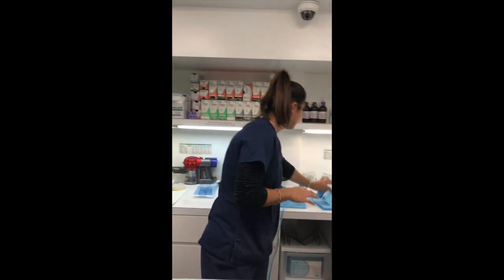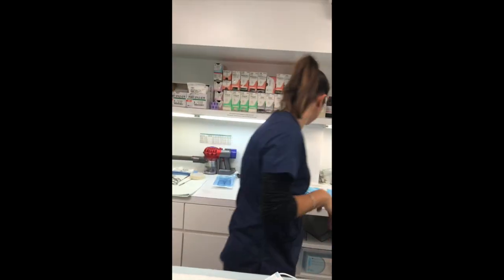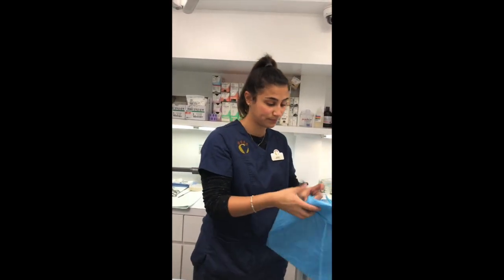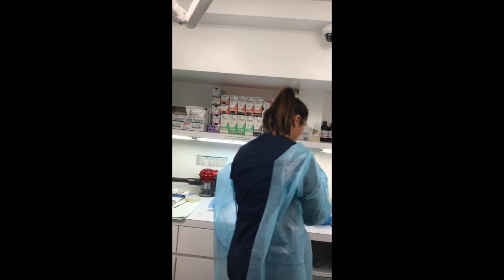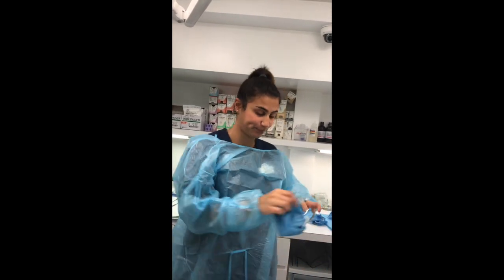So I'm just going to go over personal protective equipment that we're going to wear today. The first is going to be our mask, like this. Then we have our isolation gowns, which are going to go over my whole body. And then we also have our booties, which will go over my shoes.